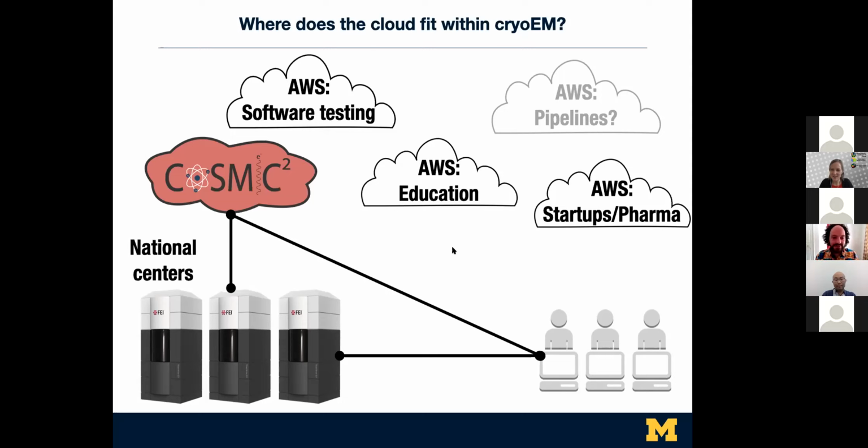So I think I would say it's sort of just people are finding it, using it, and testing it. I think as a tool, it's definitely interesting to see what it can do, what it can help you with. It's obviously a map modification tool, which requires knowing that you're modifying your map, and you should always be careful that it's what you expect it's doing to your data. But otherwise, I think it is a useful tool.